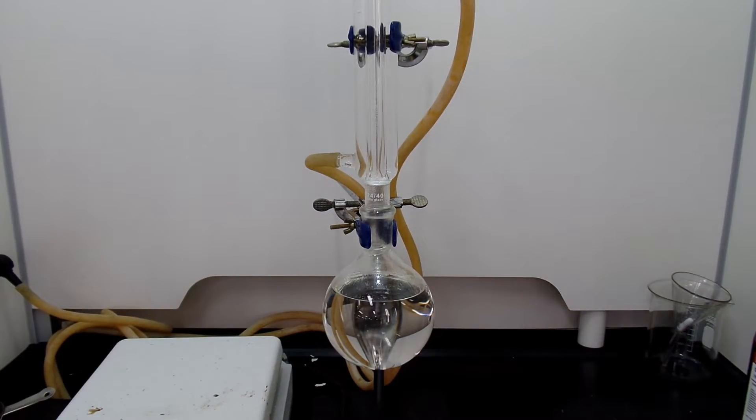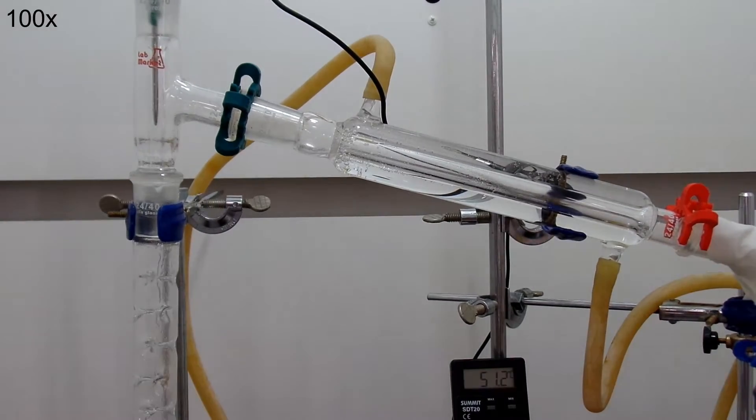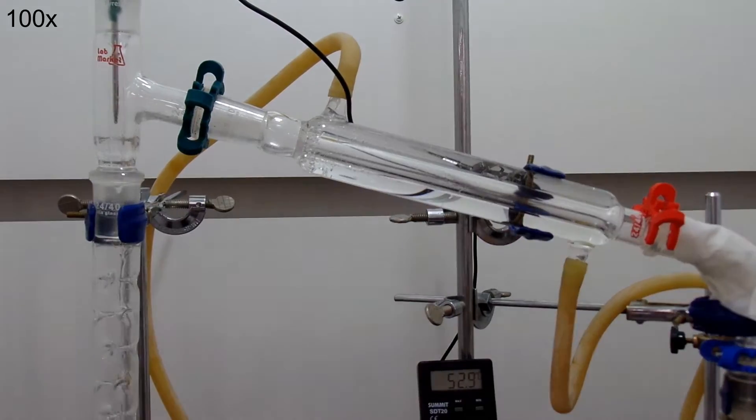Okay, that's two hours. Remove the reflux condenser and set up a fractional distillation. One bromopropane boils at 71 degrees Celsius, so collect everything around that temperature.